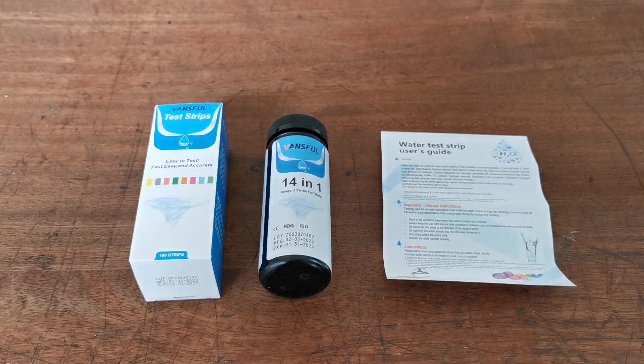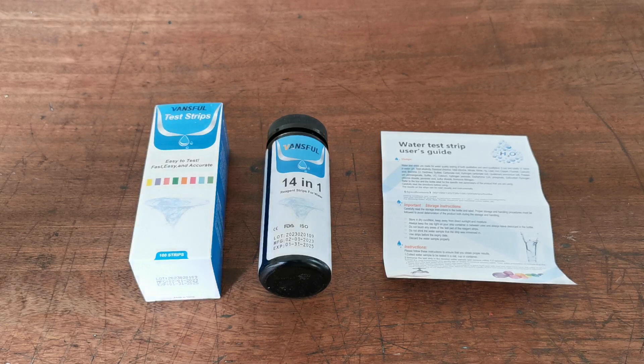Welcome to this Value Med presentation. We're going to show you what you get if you order the 14-in-1 water quality test strips that we are selling in the United Kingdom. They're made by Vansfold. You will see quite a few unbranded versions of these internationally, but these are in the original manufacturer's brand, which is the best way to buy them in terms of quality and expiry date.